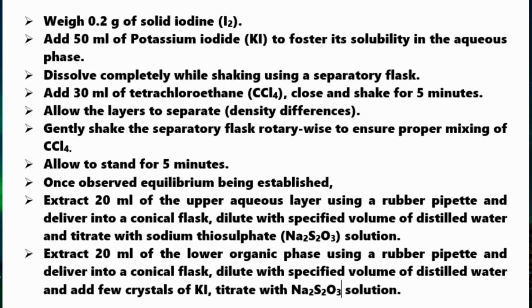So here you have a stepwise procedure in order for you to carry out this experiment and report accordingly, according to the tables that have been presented in your report manuals.